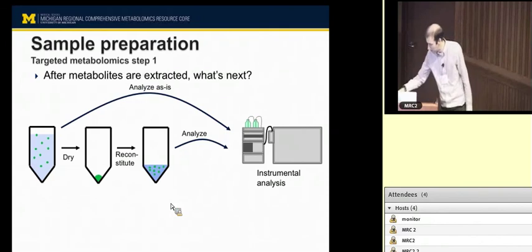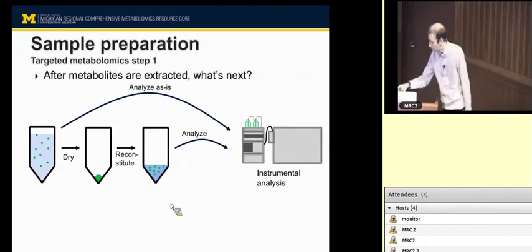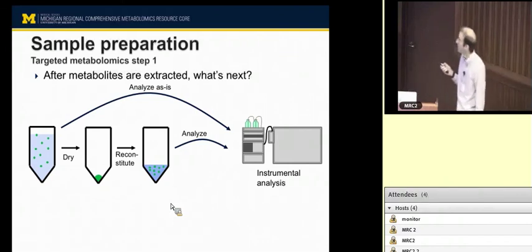Okay, so already said sample prep and instrumental analysis, very similar. Feature detection, as I mentioned before, is where we attempt to find all the signals. This is performed first on each chromatogram, each individual sample, one by one. And so we just try to find everything that looks like a peak, looks like signal that could be coming from a metabolite in all of our data. And then we go through and align them, as I already said.